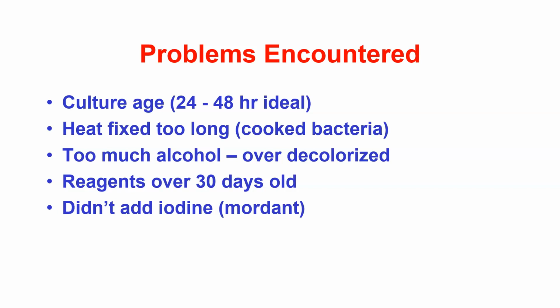So when we look at bacteria and staining bacteria, they're small, they're transparent. We have to add the stain to improve contrast so that we can visualize. Many different ways of doing this. This is in a nutshell as a couple. Watch the videos because the videos really show you how to do the procedures.